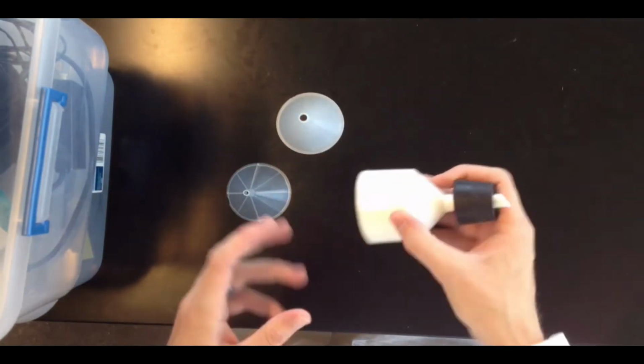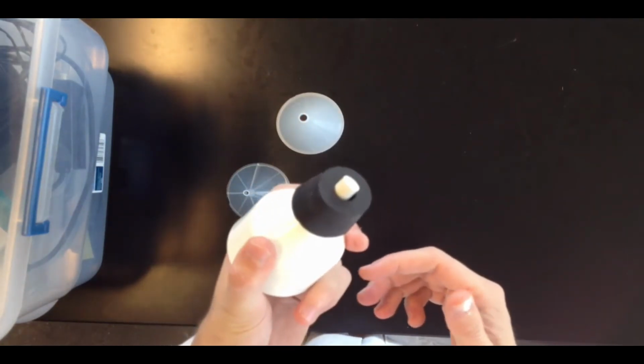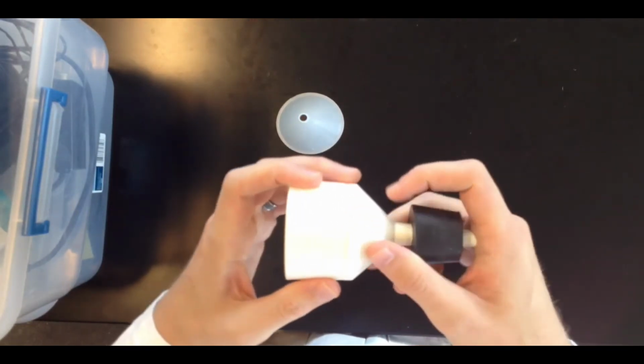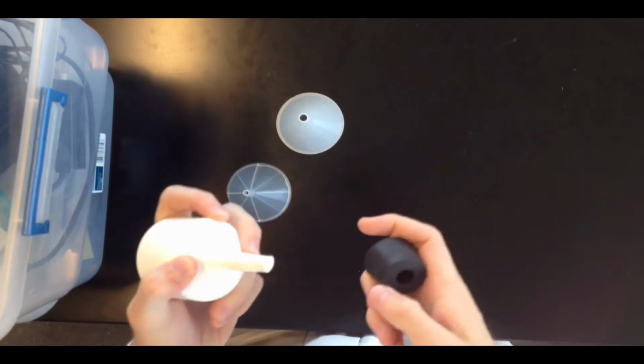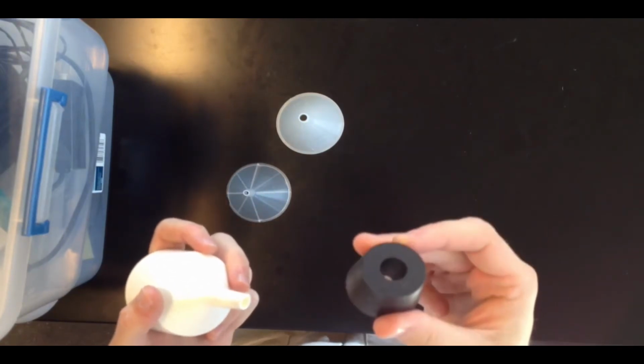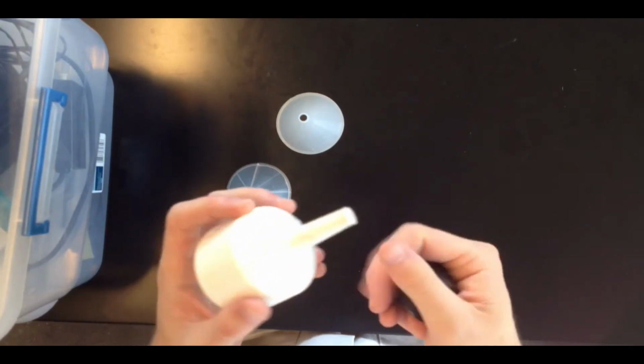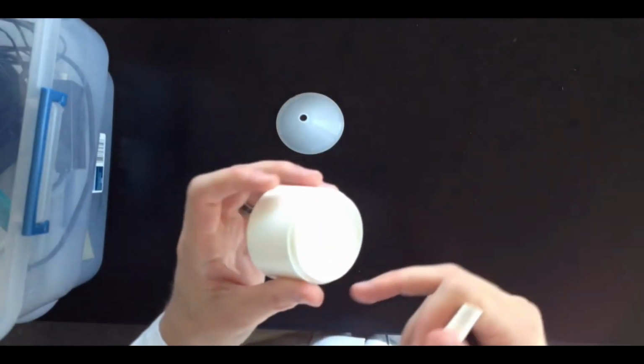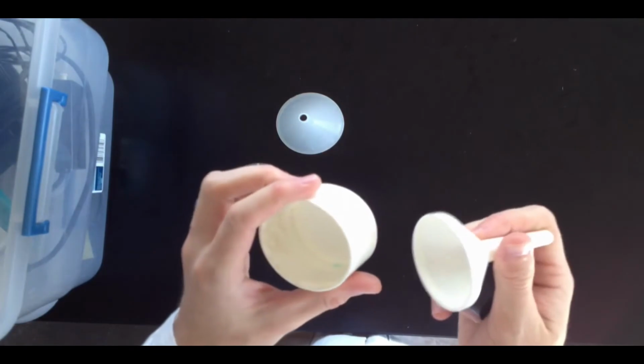And finally, the strangest looking of all is the Buchner funnel. Now you may see the Buchner funnel in your drawer as three different pieces because they come apart for cleaning purposes. One is a black stopper, and this fits into the top of a filter flask. We'll see that in a second. And then the two plastic pieces come apart so that we can clean the inside of the funnel.